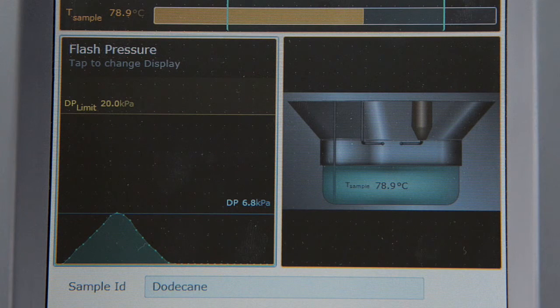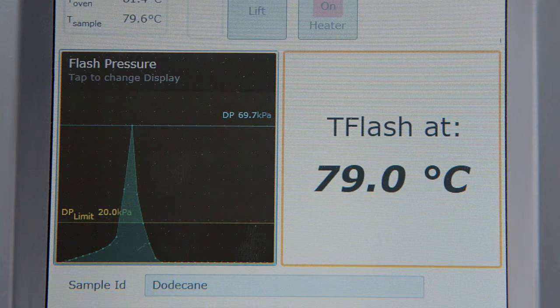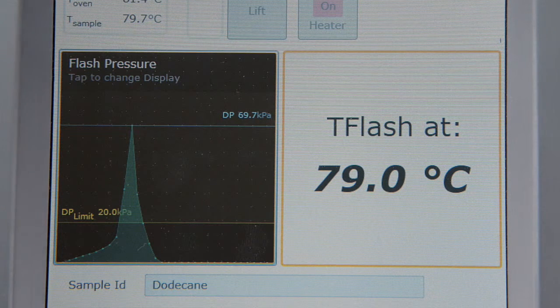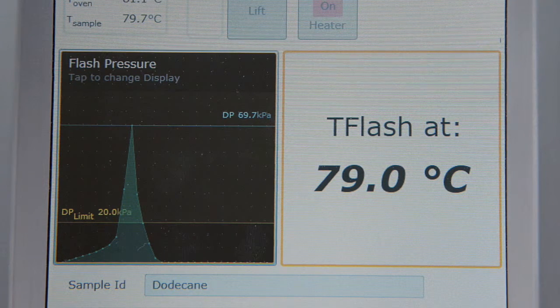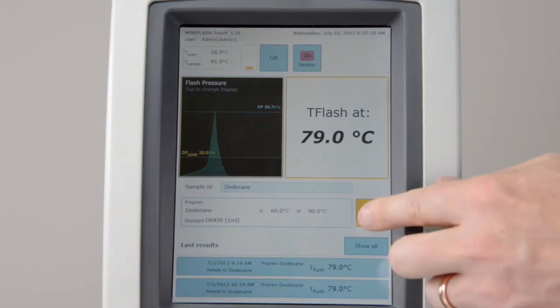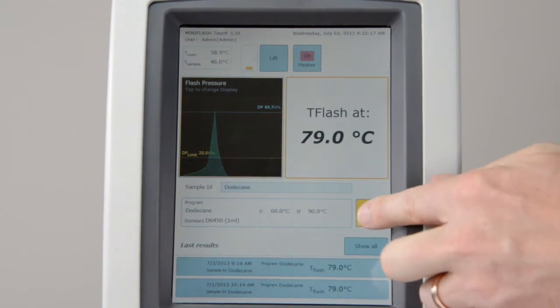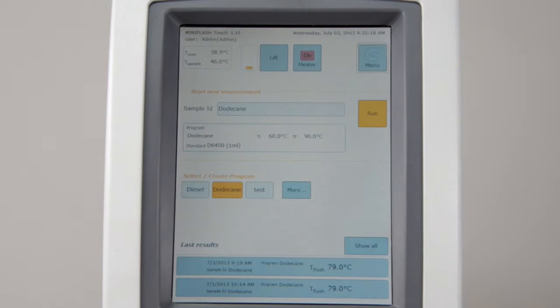When the measurement is finished, the result is displayed and the instrument cools down. Press close to get to the measuring menu again.